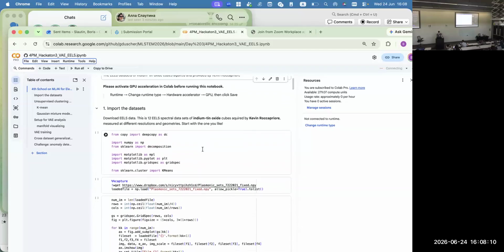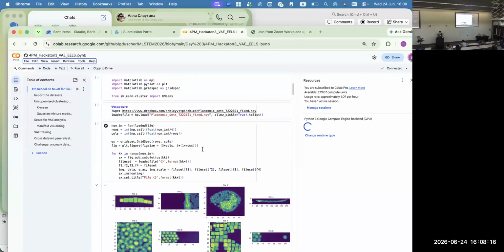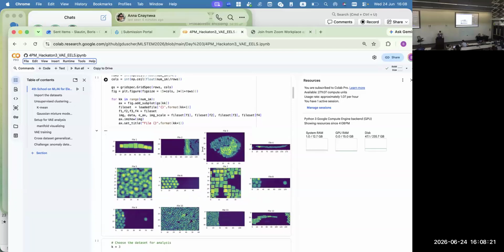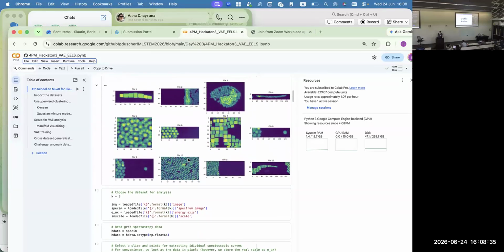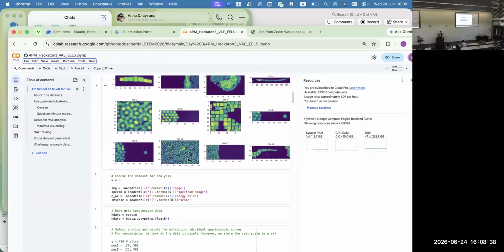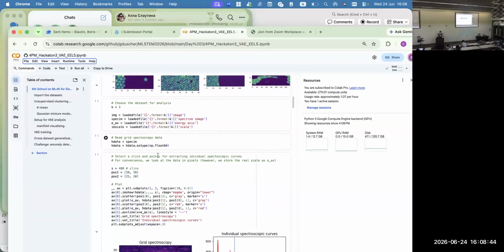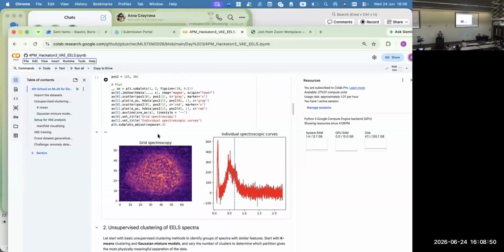After that, we would like to suggest you to play with the EELS dataset, which was acquired for the ITO cubes. There are 12 different datasets with different density of the data. Obviously, these are spectral images, meaning that each pixel corresponds to a low-loss EELS spectrum. You may select one you prefer or play with several of them. Then there are a few frames showing how you can upload the data, and some basic visualization.